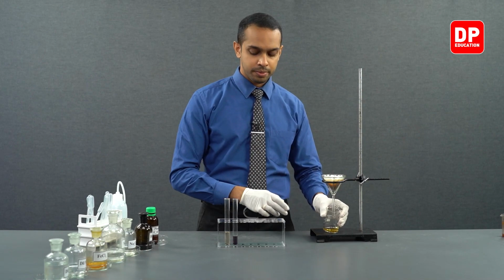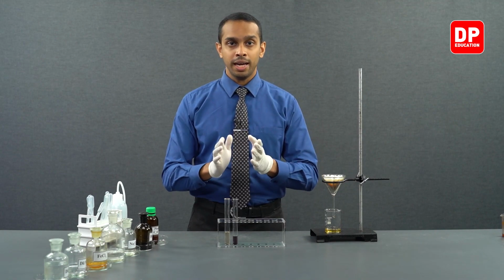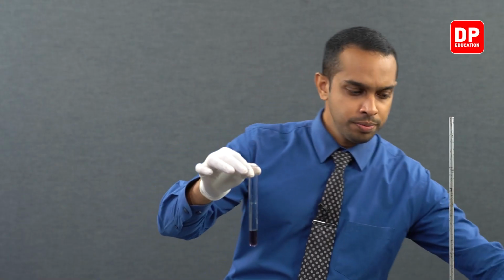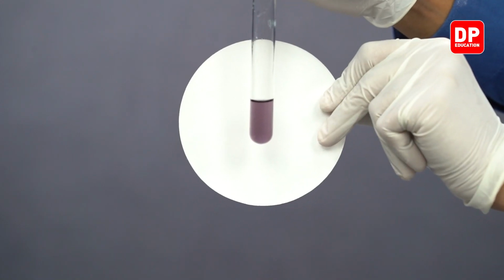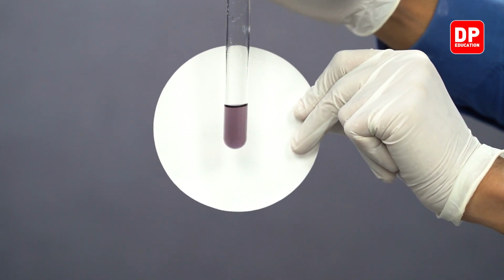Afterwards, we took a small portion of ferric chloride neutral solution and reacted it with phenol. When we reacted it with phenol, we observed that ferric chloride neutral solution reacts with phenol to produce a violet color solution.